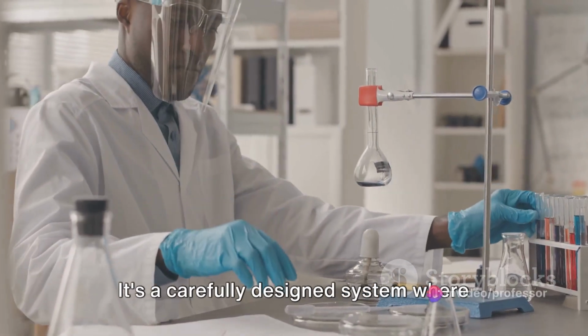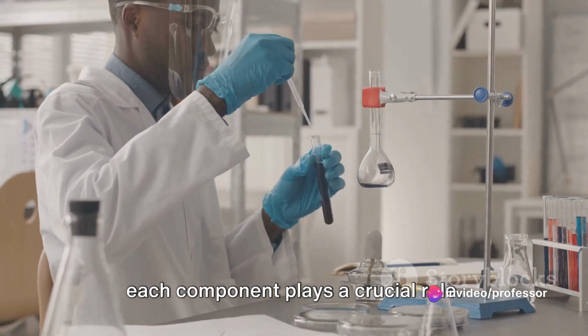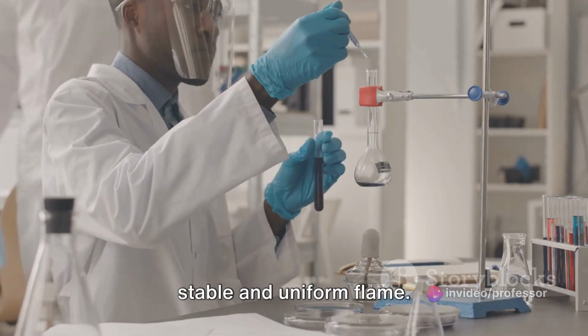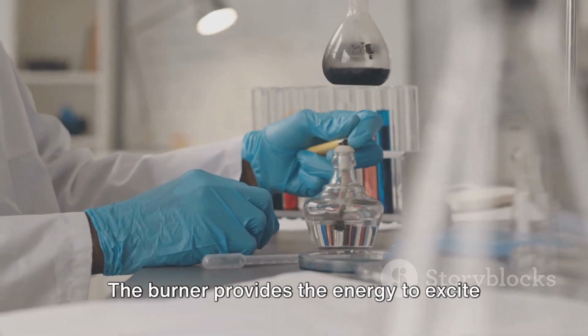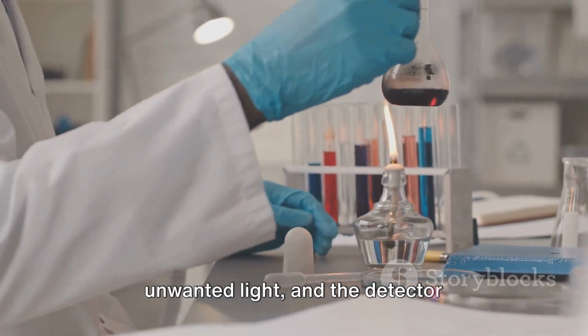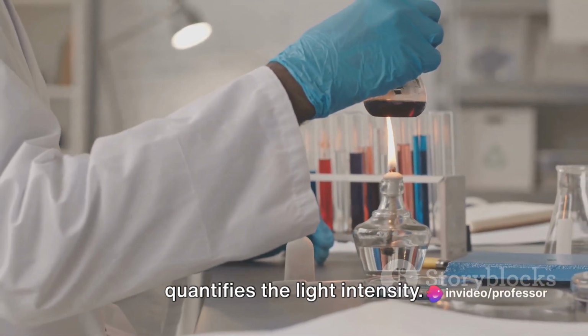It's a carefully designed system where each component plays a crucial role. The sample introduction system ensures a stable and uniform flame. The burner provides the energy to excite the atoms. The monochromator filters out the unwanted light, and the detector quantifies the light intensity.